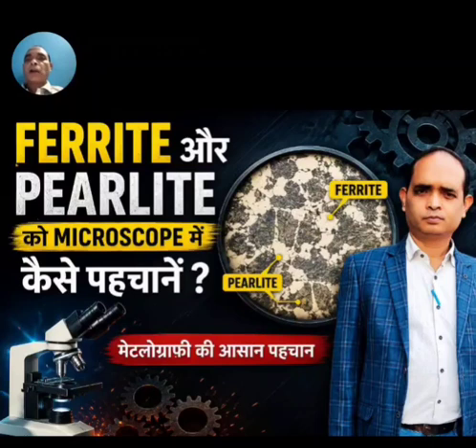Now let us discuss how to identify ferrite and pearlite. Ferrite appears bright or white because it is less affected by the etching solution. Pearlite appears gray or dark because its lamellar ferrite-cementite structure reacts differently during etching. At 100x magnification, ferrite appears as bright regions, while pearlite appears as dark patches. At 500x magnification, the lamellar structure of pearlite becomes much more visible.